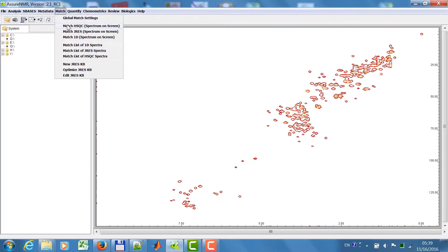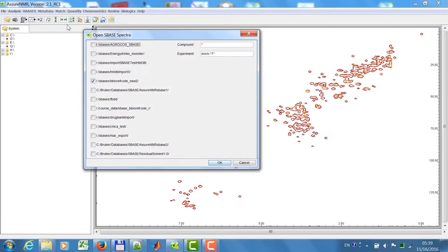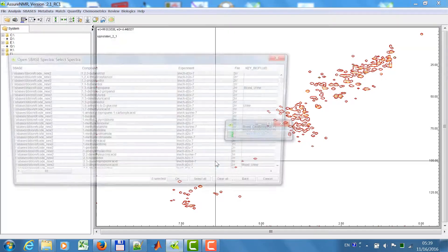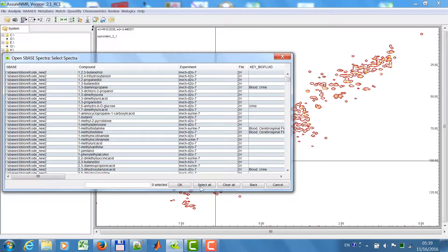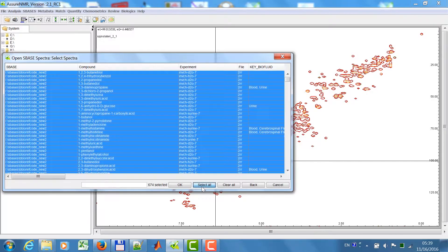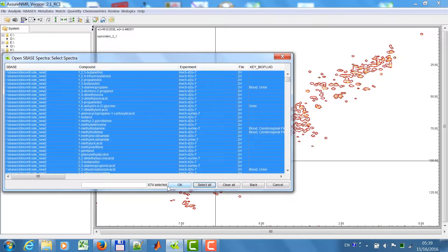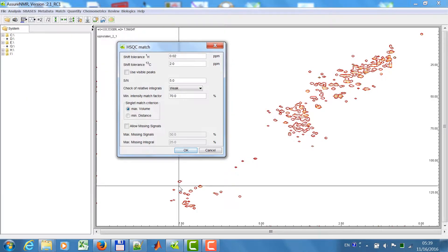I go to match, match HSQC. I select spectra from my database, in this case the BiBioRevCo database, all HSQC spectra of pH 7. More than 600.